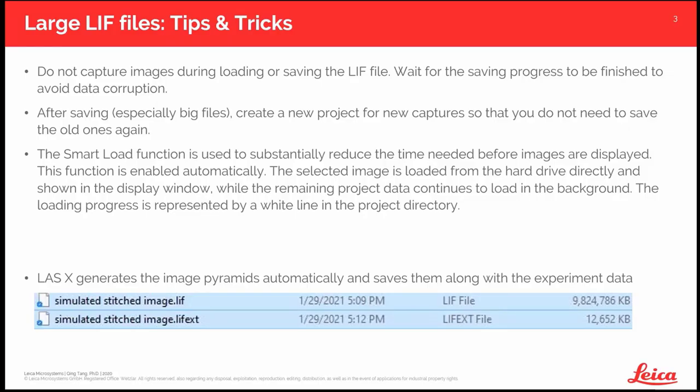A few tips and tricks on handling large LIF files. During saving or loading, do not interrupt. It might take quite a few minutes if you are saving, say, 100 gigabyte data. After the file is saved, create a new project file if you continue to capture images. In that case, you do not need to save the previously saved project again.